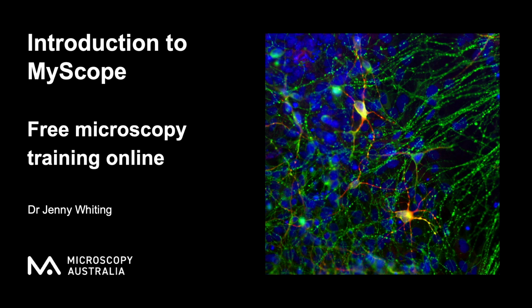This is all about an introduction to MyScope. Now, MyScope is our free online training platform, and particularly in this time of lockdown and remote working and having limited access to instruments and hands-on training, we thought we'd present this to you to really give you that bit more opportunity to get involved in some training, and help your users to do some training even if they can't come and spend some time with you on the instruments.